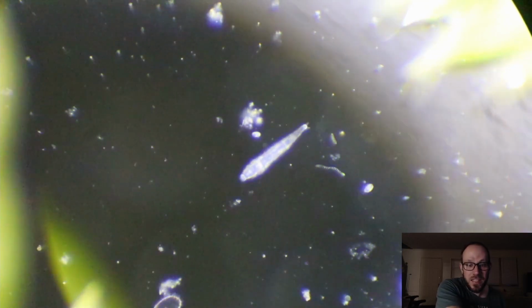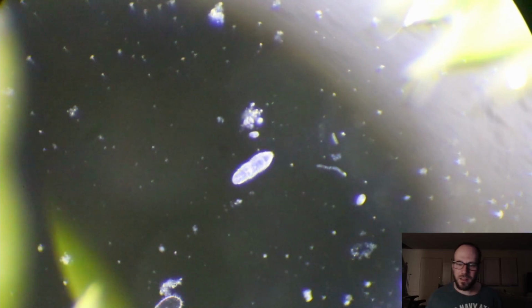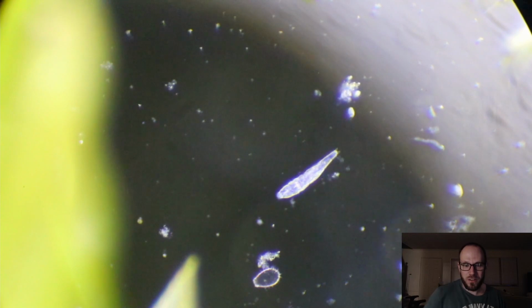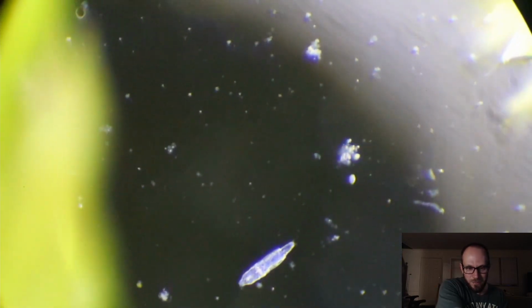Like a chainsaw. Yeah, it's so cool. I think Samara made that comparison too, actually. When she first saw it, she's like, oh my god, he's doing a thing! Like, yep, that's what the Rotifer do. Look at him. Oh, get it.